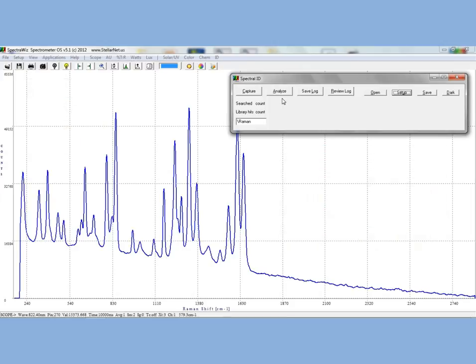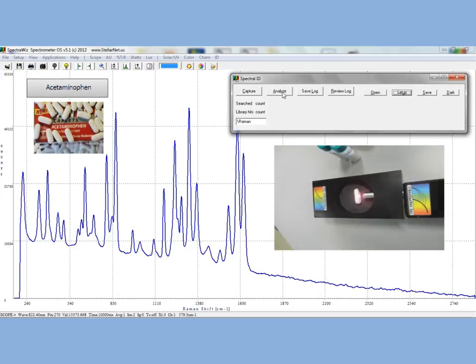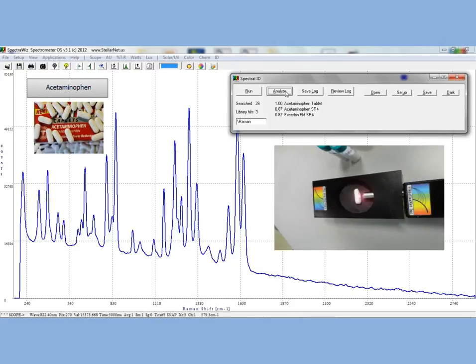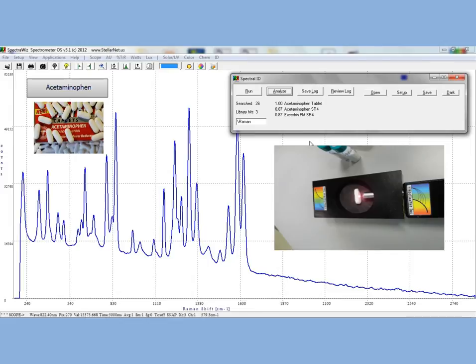You can see, when we click the Analyze button, that we get some other matches in addition to just the acetaminophen tablet, such as Excedrin, which is another over-the-counter headache pain reliever medicine, which contains acetaminophen.